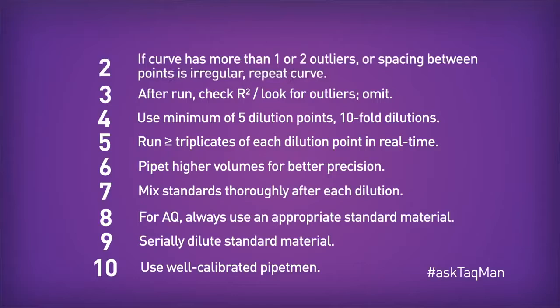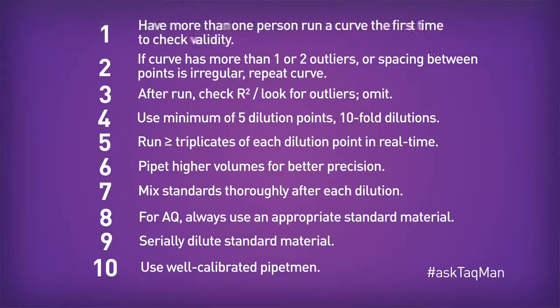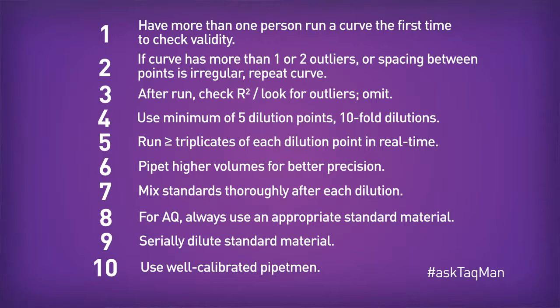Number 2: if the curve has more than one or two outliers, or if the spacing between any of your points is irregular, repeat the entire curve, including doing the dilution. And number 1: have more than one person run a curve the first time to make sure that the results are in agreement.